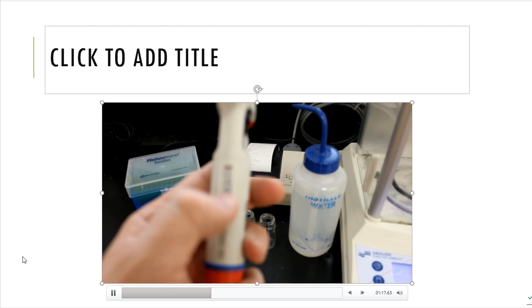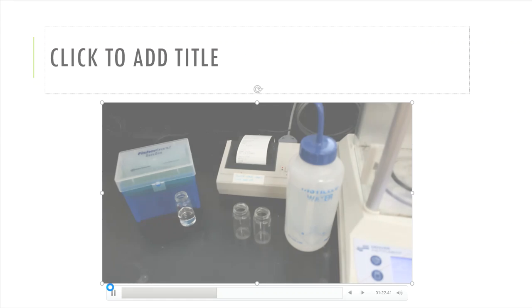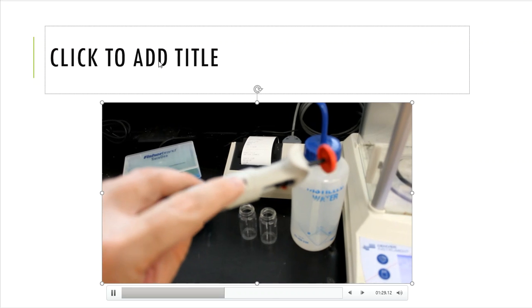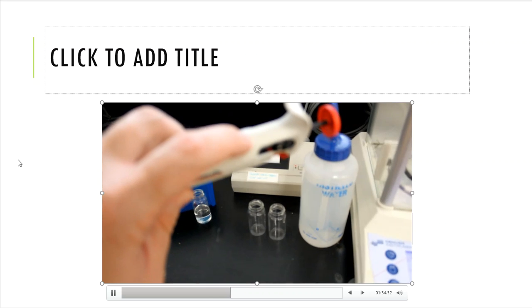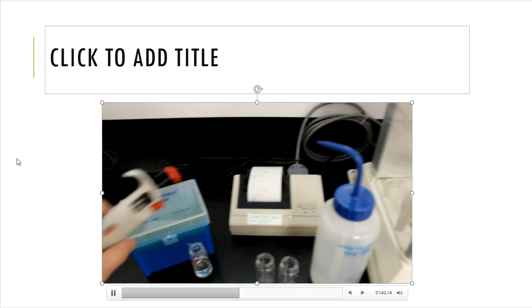The problem is that this only has room for 3 digits, and this goes up to 1,000. When I do this, 1,000 is 4 digits, and this only has room for 3. So when this says 100, that is actually 1,000. When this says 080, that is actually 800 at that point. So that last digit is chopped off of the micropipette.